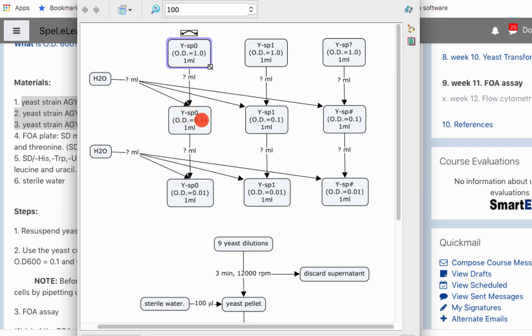So optical density is equivalent to the concentration of the cell in the suspension. Once you solve this question mark using C1, V1, C2, V2, you're also going to figure out the amount of water to use. So these 2 volumes combined should give you 1 milliliter total. Here, these 2 numbers together should add up to be 1 milliliter. So here's how to solve this question. And then you're supposed to fill in all the question marks in this table that are up here.